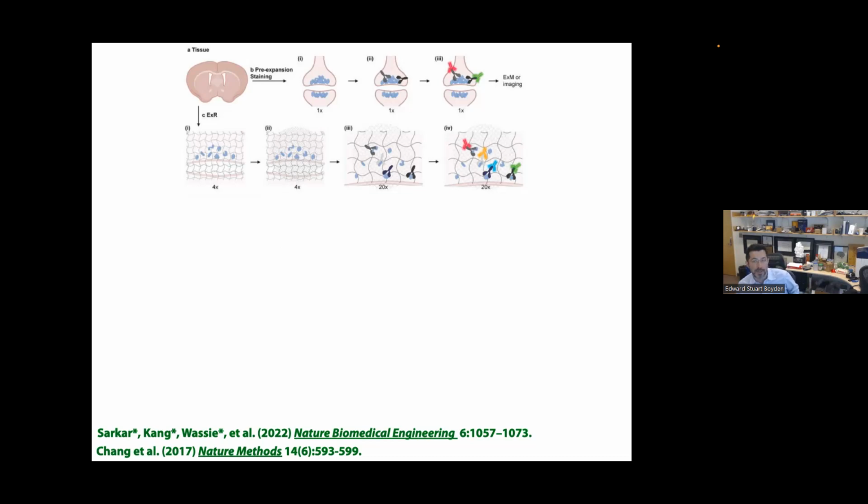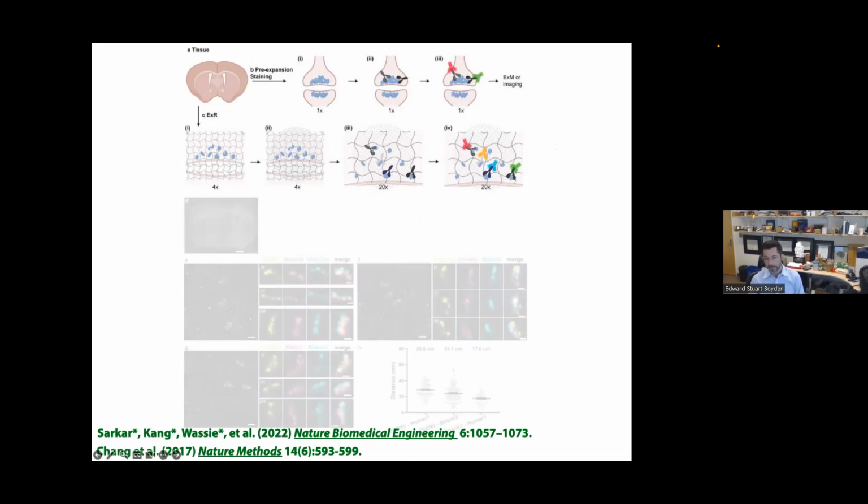The cartoon at the top illustrates how this works. In the top row of the cartoon, the green and red antibodies decorate proteins on the outside of a complex, but they can't get inside. If we pull the proteins apart, though, now the yellow and blue antibodies can penetrate into the complex and label their targets. Now, many proteins, of course, are connected to other proteins. That's how many of them work, right? Biomolecules work by talking to other biomolecules. And by talking, I mean binding and altering each other, right?